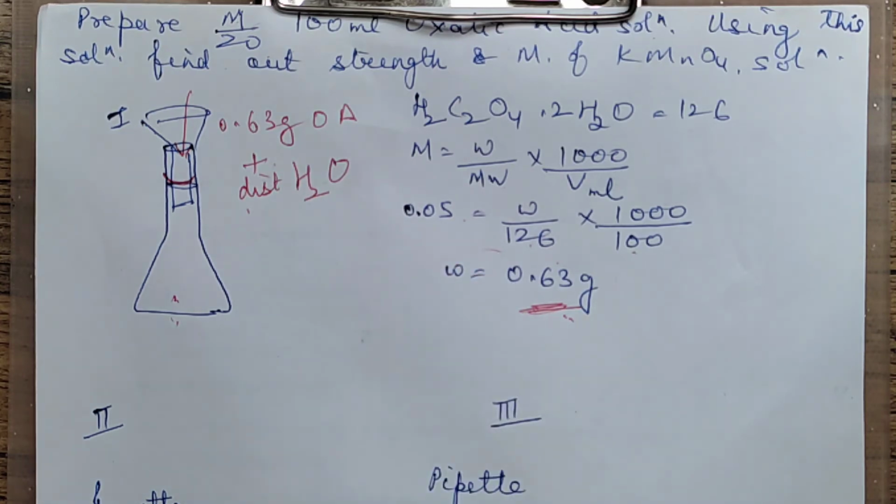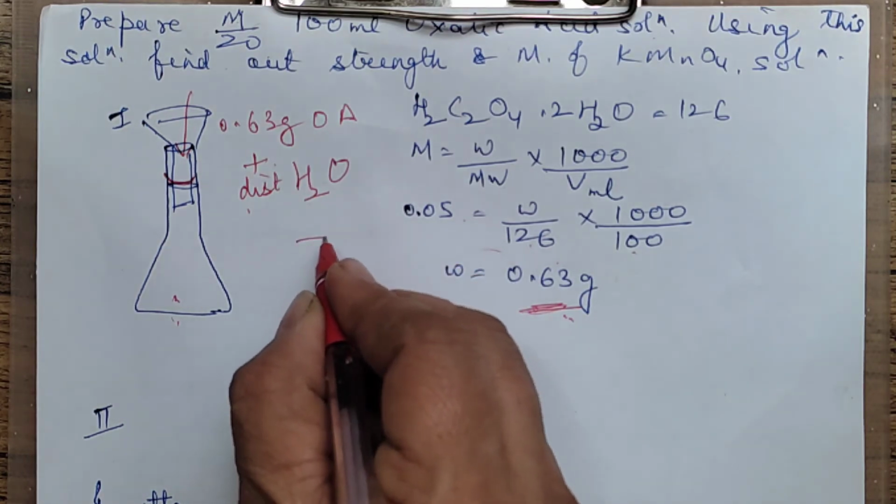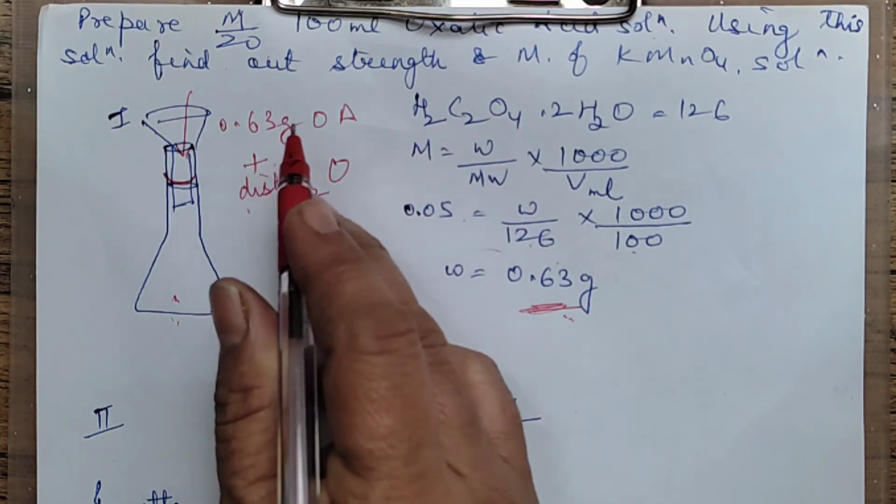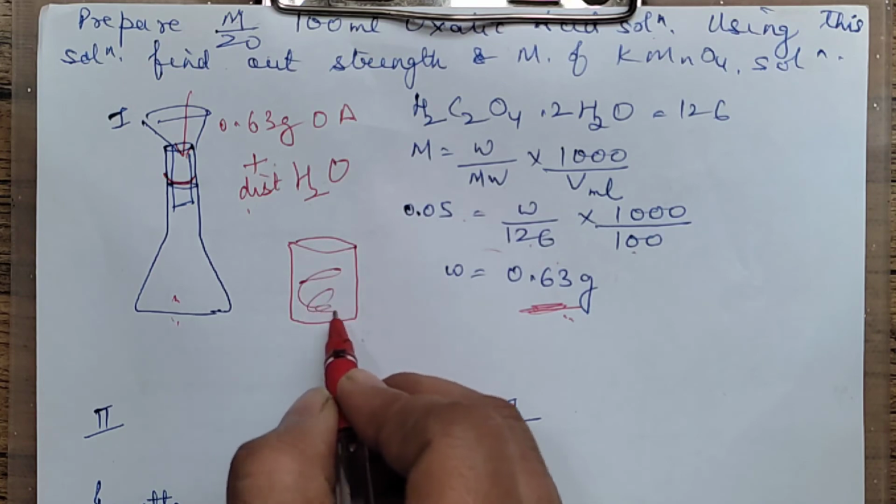Now you can take this and pour it in the beaker. Every time to take from the standard flask is difficult. Pour this, transfer this standard solution in the beaker.